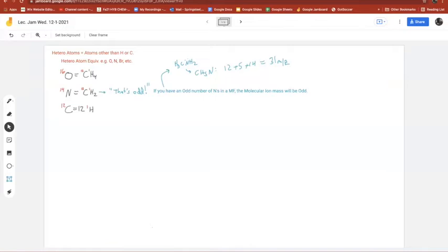Another interesting molecule is bromine. So you know carbon 12 and carbon 13 are the most abundant isotopes, and it's like 98% carbon 12, 1.2% carbon 13. And hydrogen 1H is like 99.99% this one, and then a tiny amount of the other, I'm not even sure of the number. And then oxygen is about 100% oxygen 16, and nitrogen is about 100% nitrogen 14, right? So it's almost all just one isotope for these atoms.